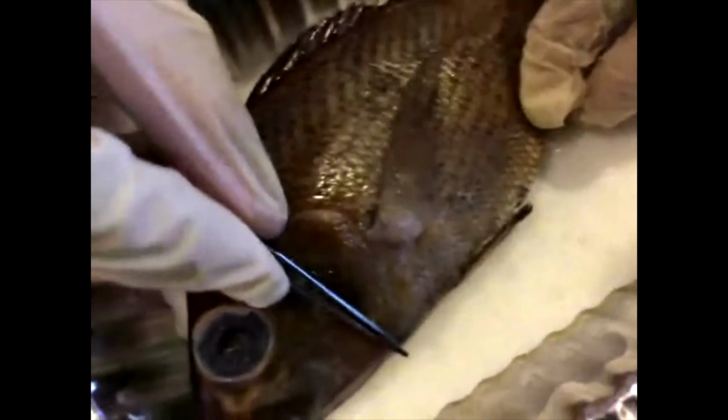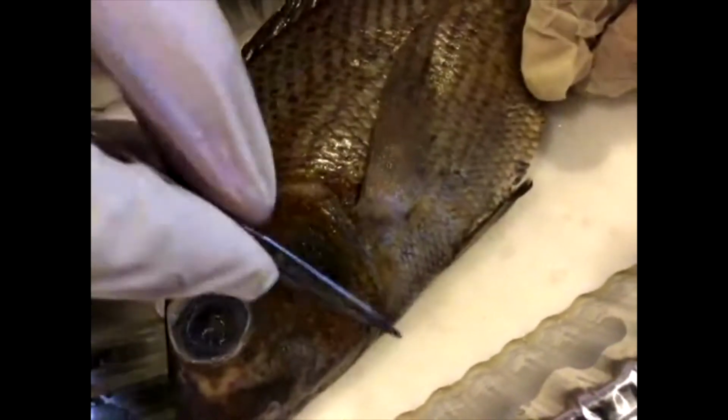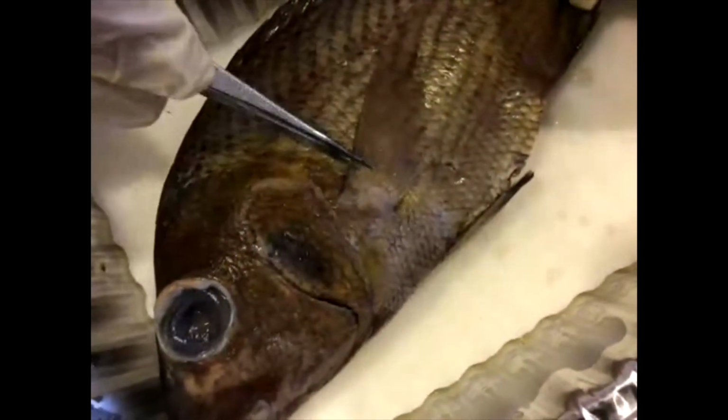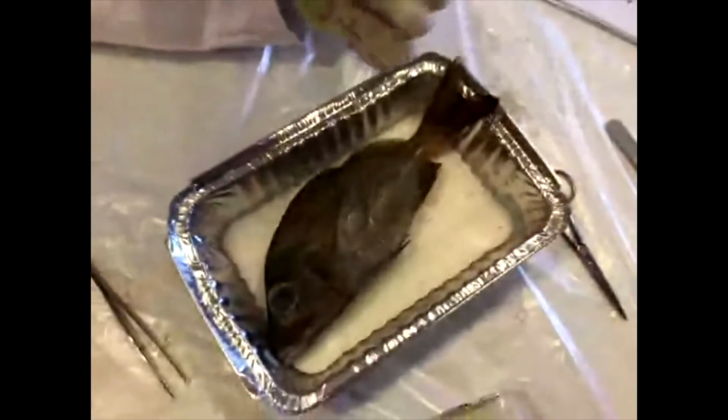But this operculum will be moving like this kind of throughout life. Now, you can draw the operculum, but when I start to dissect, I'm actually going to draw a line kind of up through here. So it might be best to leave it for now, and this will be part of the window that we're actually going to look in for the fish. Okay, I think that we're ready to start cutting.